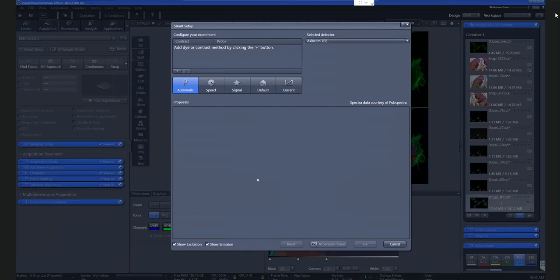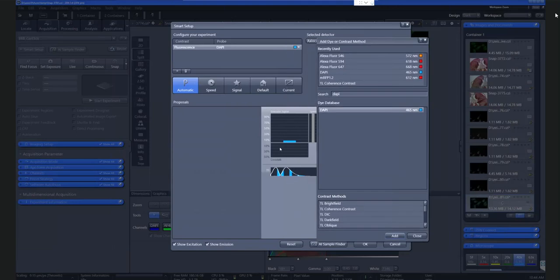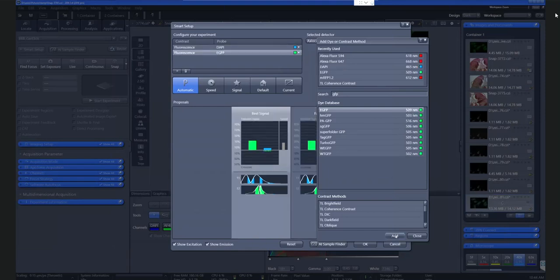And if there's nothing shown up like here, you just hit the plus and you say, okay, let's do some DAPI. Okay, the DAPI channel. And we already get something. And maybe the GFP as another one. There's a list of different GFPs, but they all look pretty much the same, so you can pick the first one. And maybe again the RFP. Whatever you used last, you'll find in this list up here. So you can do this as well.